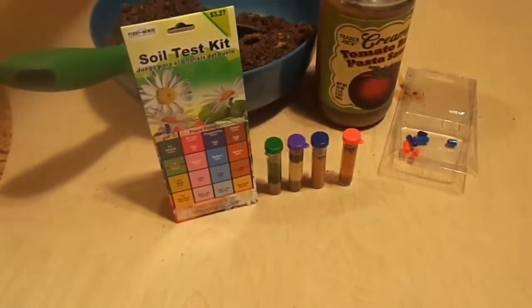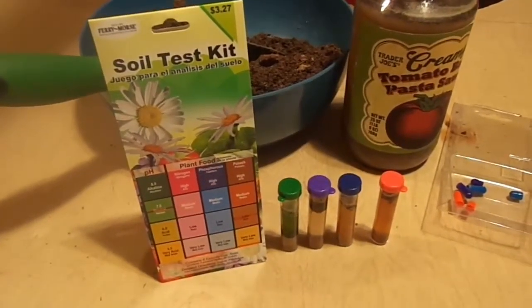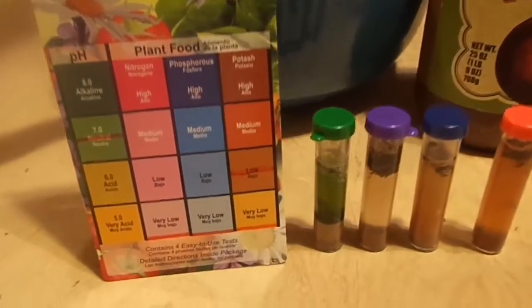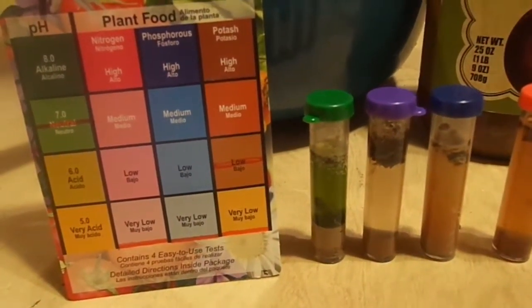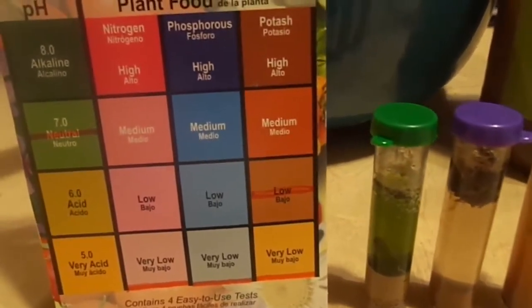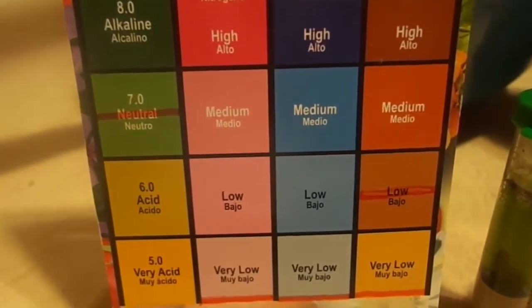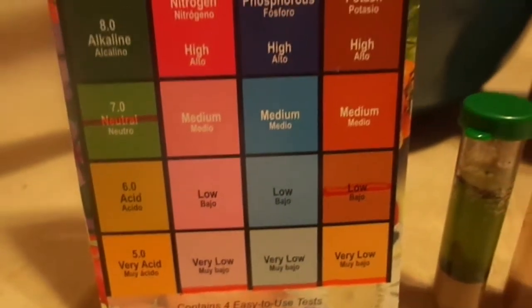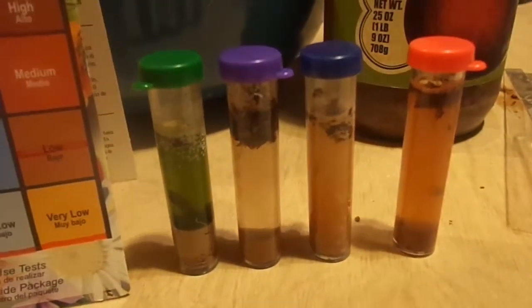I question the accuracy because in the two middle test tubes — the phosphorus and the nitrogen — I had a hard time even getting any color to show as an indication, and I questioned that my soil was that poor. But that being said, it can be. I used an orange sharpie to mark on the graph where I thought my soil appeared, and later I raised the potash to low rather than very low, and you can see why in the picture.